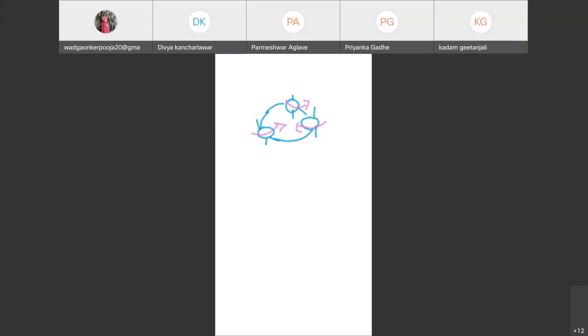Orbit, at that time, if it is representing the spin, simply when you have the nucleus, that nucleus is also having a spin. It must be revolving with a specific spin.